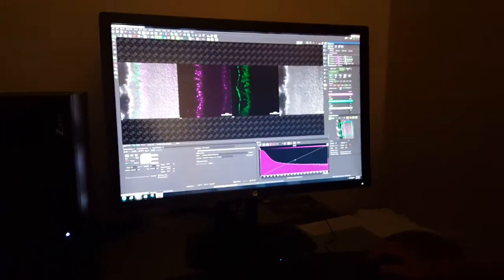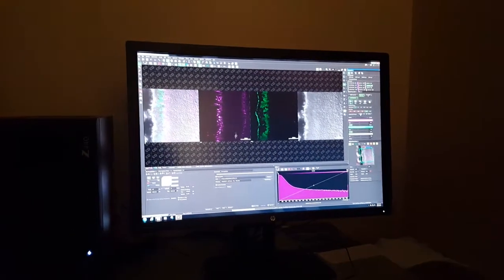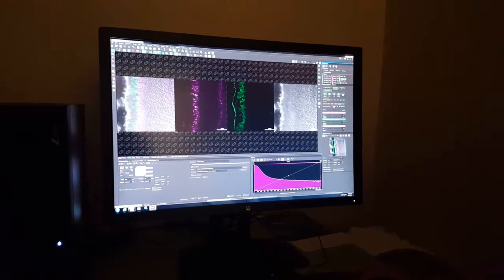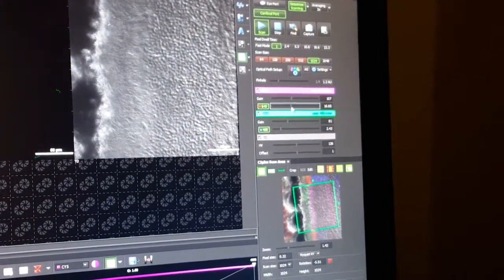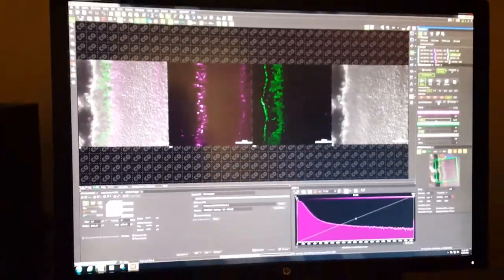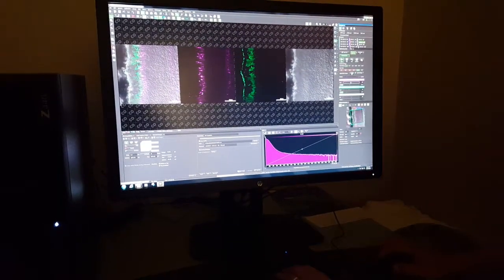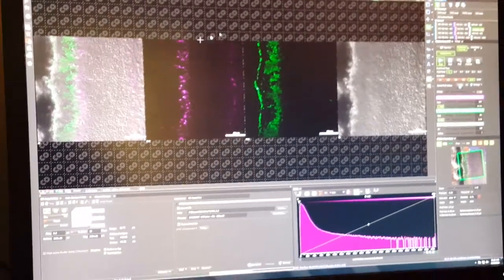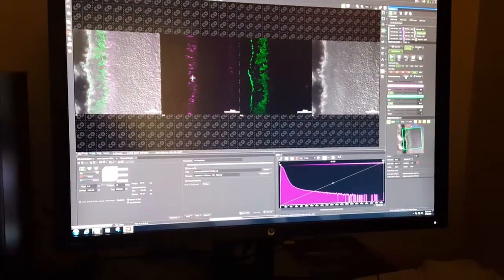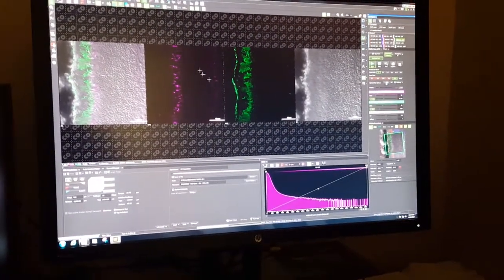So in this case, I want to click the pixel saturation indicator, and when I click it, I realize that my PNA is saturating here. So I'm going to decrease the laser power up to 120, and to 15 or 14, and then I'm going to start decreasing the gain, because I know that I can go down until 100, and that is the optimal. And now I'm at 100, and I do not have any saturation, or just 1 pixel here. I can go down a little bit, and I'm okay here and here.